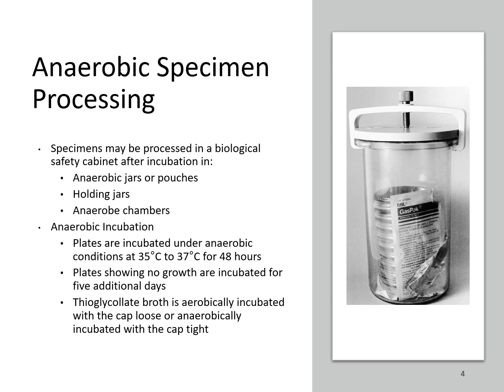That gas pack will remove the oxygen, and so that environment will stay anaerobic without the presence of oxygen. You can do this same process with bags to put these cultures in. Depending on the lab and the amount of cultures that they get for anaerobes will depend on which method they use. A lot of labs will just use the anaerobic bags.